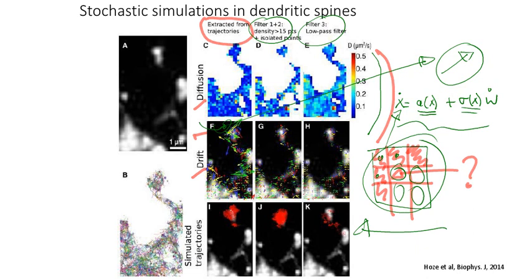So here we generated a trajectory starting at one point, and we're interested in how this trajectory, for example, evolved. I'm doing it by hand in this structure. So we use now the confocal information, although it is not as precise, but it still gives us the shape of the structure to see when, for example, a trajectory arrives to a region of interest, as we've shown here.